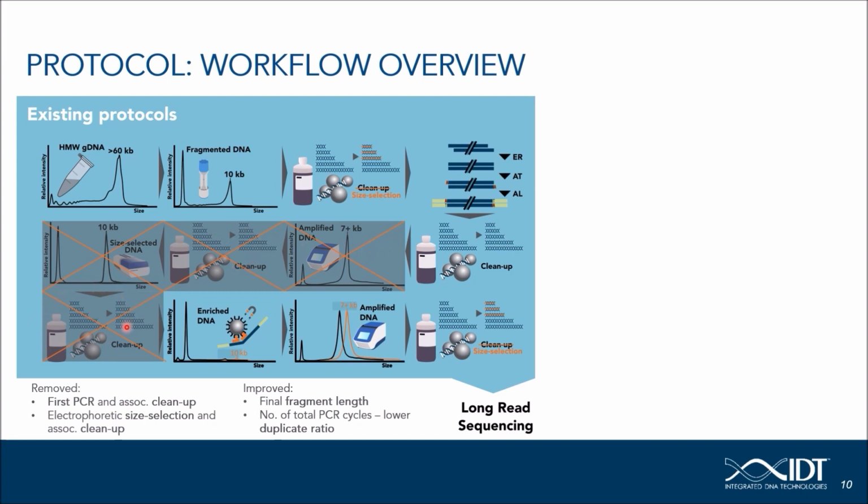In terms of quality, we also ended up better off in the very end because of the higher yield, the higher recovery rate of that bead-based size selection. We had to perform fewer PCR cycles in total, ending up with a longer fragment length and a lower duplicate ratio.